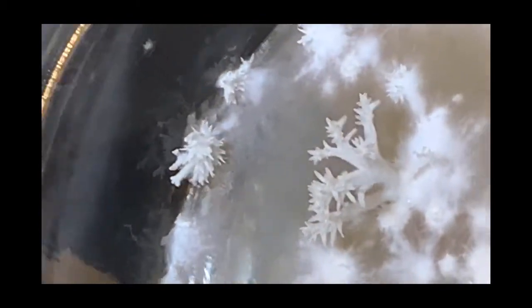Let's see if I can get in any further. No, the iPhone won't let me bring this up. Let's see if it'll stay focused. And that's really beautiful, I think.